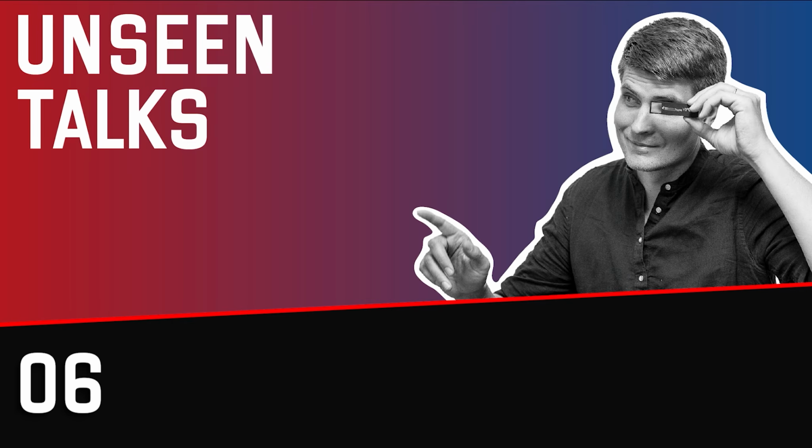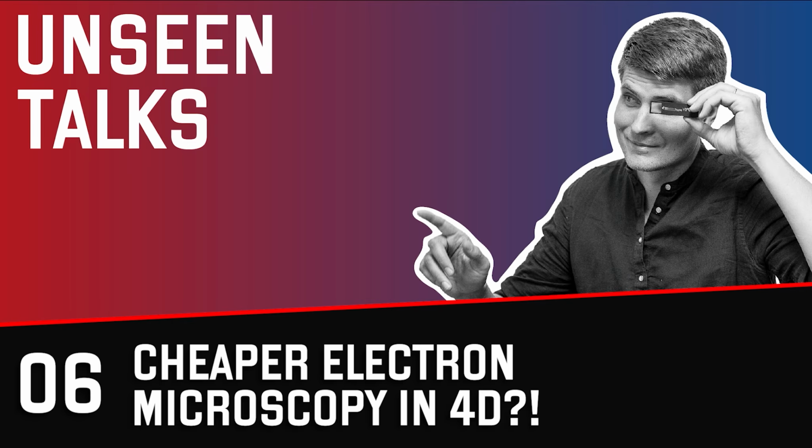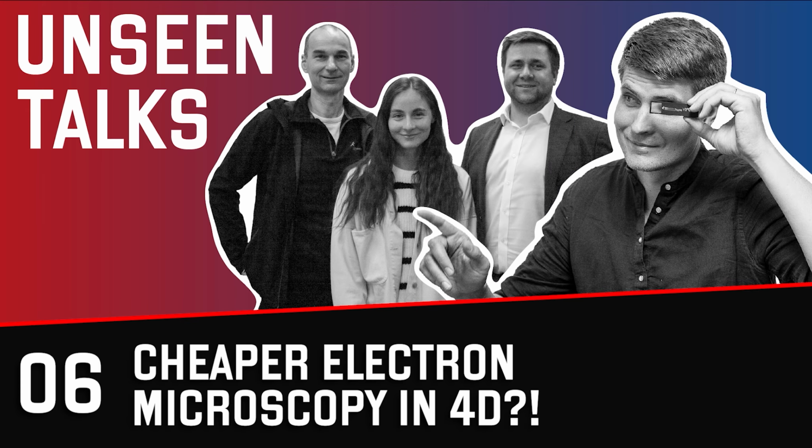Hi! What unseen things will be revealed in this episode? Today we will dive into the world of four-dimensional electron microscopy. We will show how, thanks to a new method called 4D STEM in SEM, an ordinary scanning electron microscope can compete with much more expensive ones.